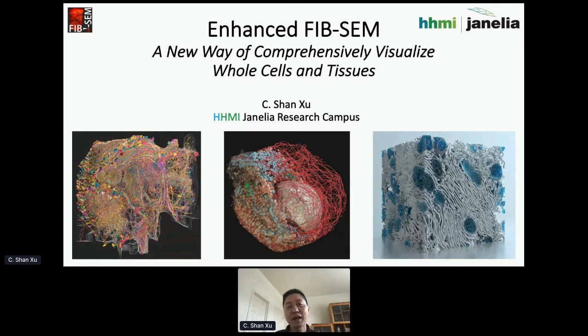Anyway, today I would like to talk about a new form of microscopy that's based on electrons, not photons, what you have heard in the past 2 days. It's called FIB-SEM, or focused ion beam scanning electron microscopy. Of course, we are not looking at live samples anymore with EM, but I hope these frozen-in-time snapshots, you can see on the bottom here, provide a new perspective on how we visualize the cellular world at nanometer resolution and in the context of whole cells and tissues.